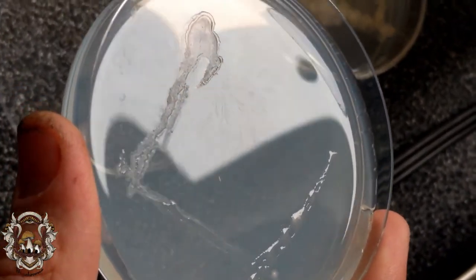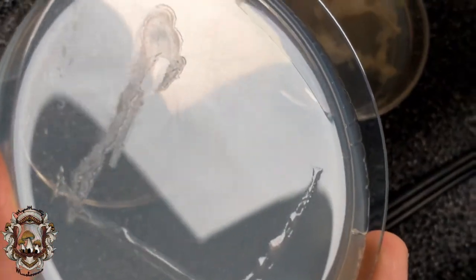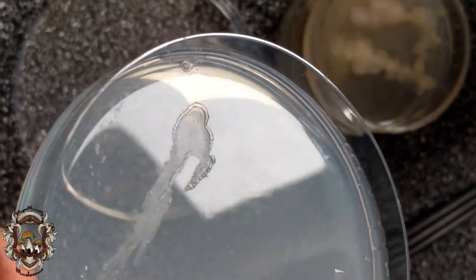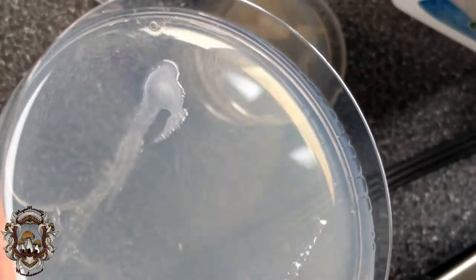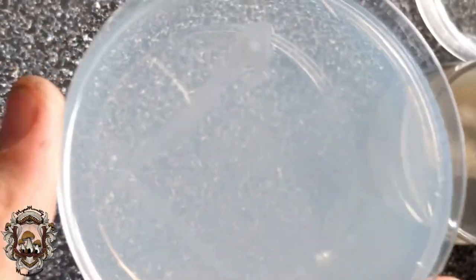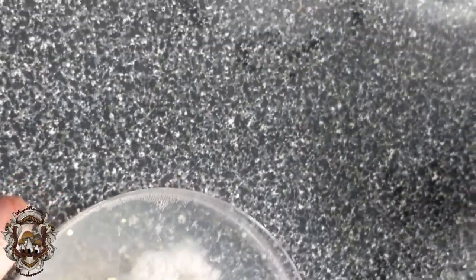This one did get some weird mycelial growth though right here. You can see it, and actually it grew pretty rapidly with no nutrients, so that made me wonder for sure. Might be able to see it. Reflection of it, at least. Yep, and then this was the most interesting one, I guess.